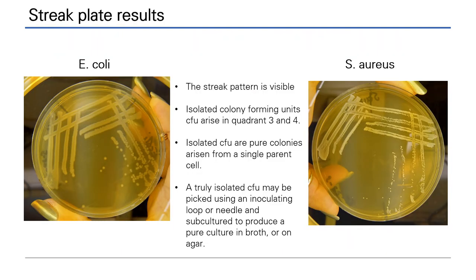These are the results from the streak plates which you observed in the previous video. E. coli and staph aureus were both used to perform the quadrant streak plate. On the left, you can easily see that E. coli has been diluted around the edge of the plate. And in the fourth quadrant, you can see nicely isolated colony-forming units. These colonies can easily be picked with a loop or an inoculating needle and transferred for subculture into either a broth or an agar plate.